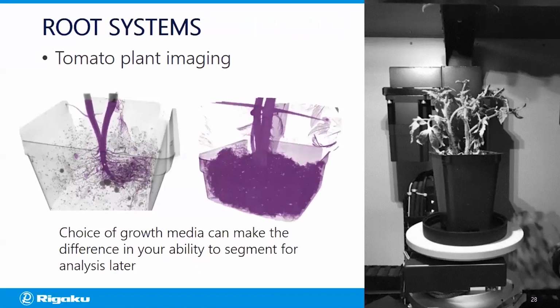And in this particular experiment, tomato plants were grown in two different soil types. And the question in this case was which growth media was best for our CT imaging experiments of these plants. So the tomato plants were imaged with identical settings on the same instrument. On the left side, the tomato plant was grown in a basic peat mix, while on the right, the plant was grown in coconut coir, which is an organic growing medium that's supposed to be really good for holding water well.